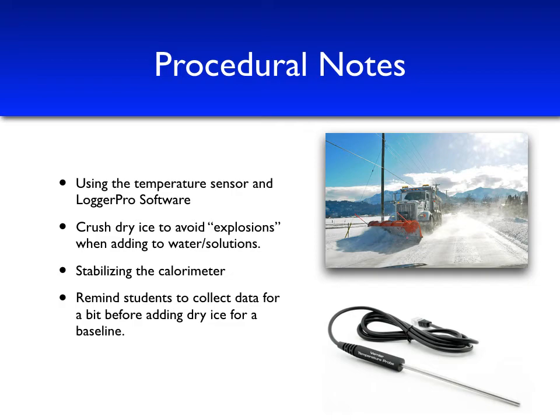It is also important that as we collect data, we create a baseline before we start adding our dry ice. That way we can look at the difference in temperature between starting the experiment and ending our experiment.